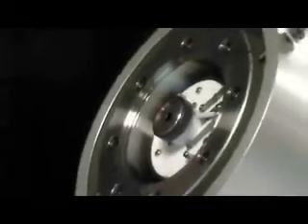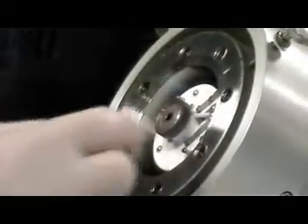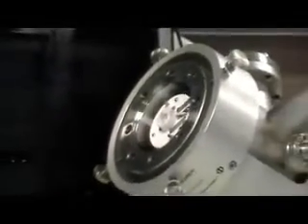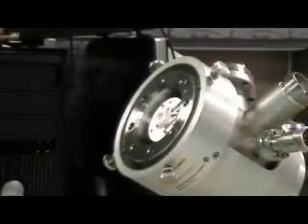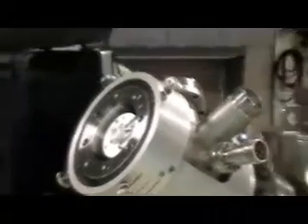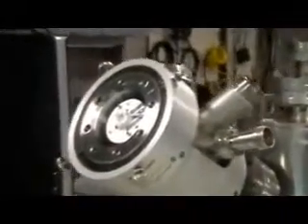You notice that we're wearing gloves. You want to wear gloves when you remove this because you don't want to get the oils from your fingers on these parts. We also cleaned our screwdriver and tweezers with some isopropanol before using them on this ion gun.